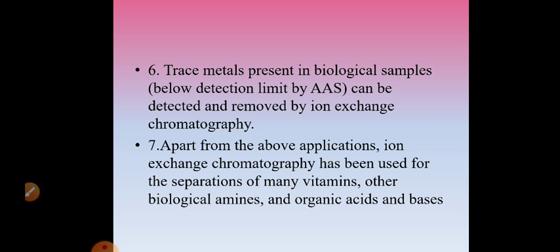So apart from all the above applications, ion exchange chromatography is used for separation or purification of vitamins, other biological amines, organic acids and bases. So that is all about ion exchange chromatography.